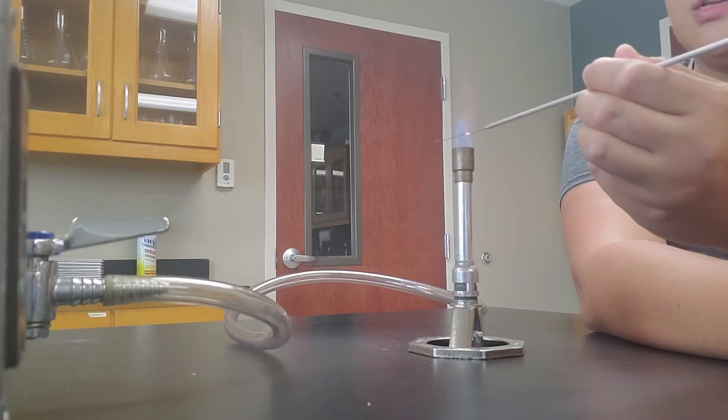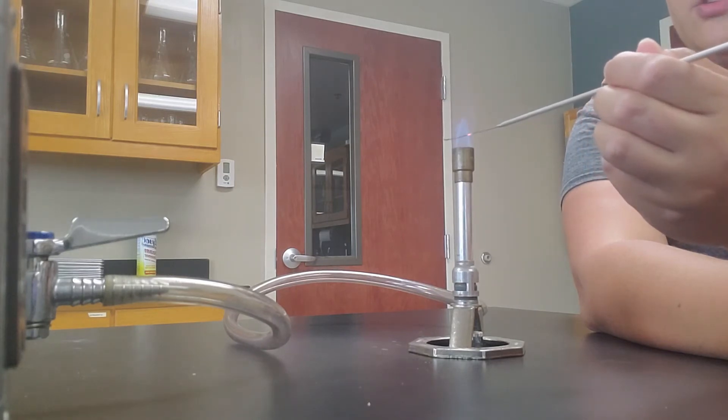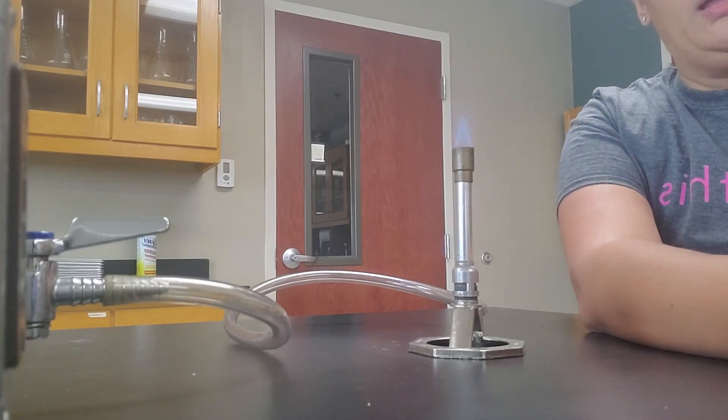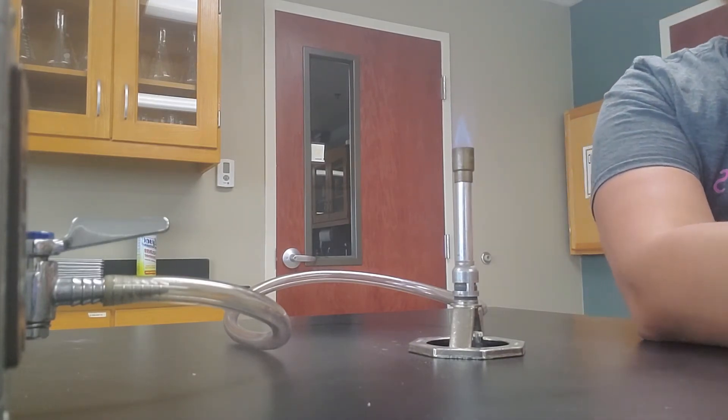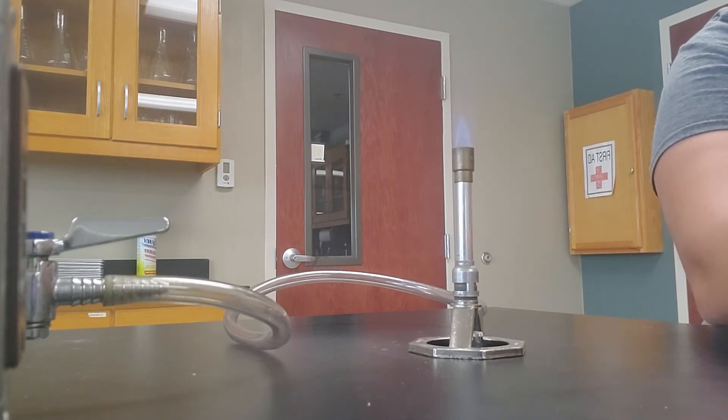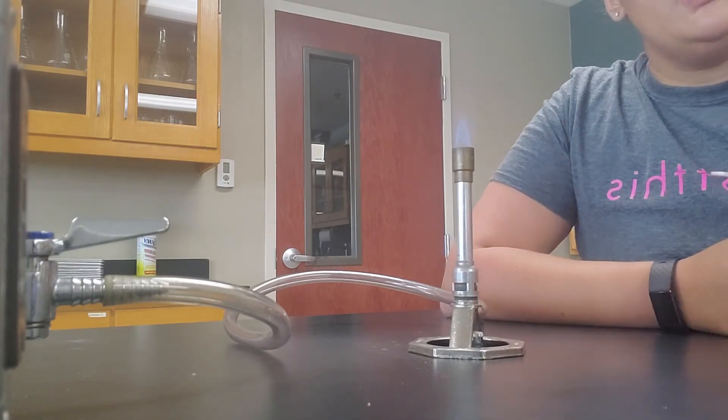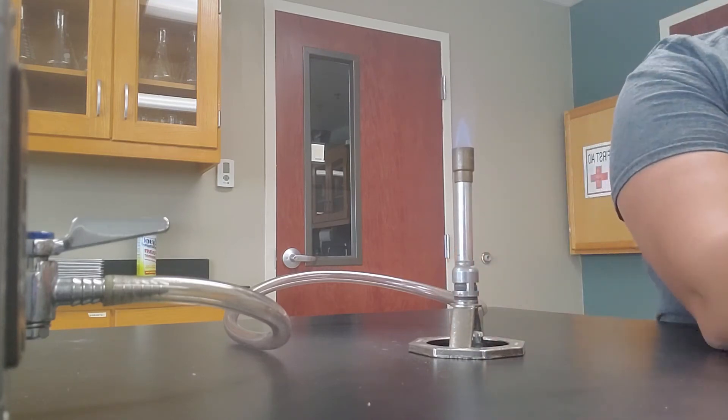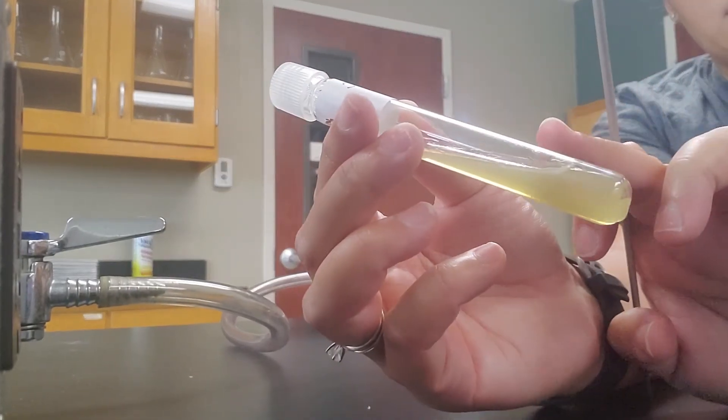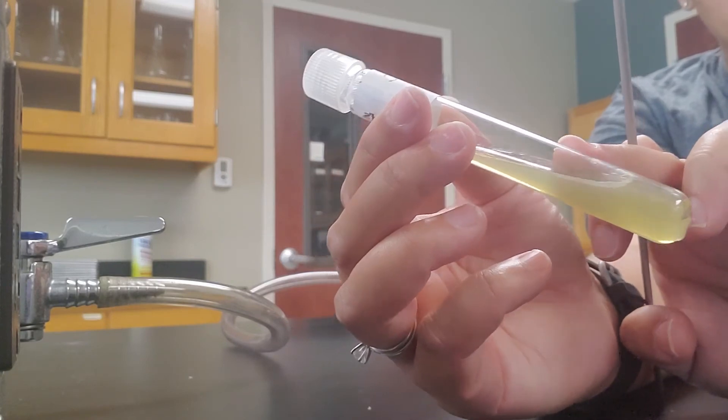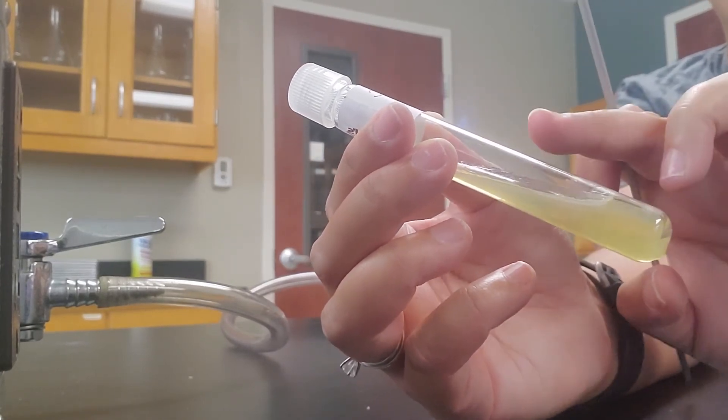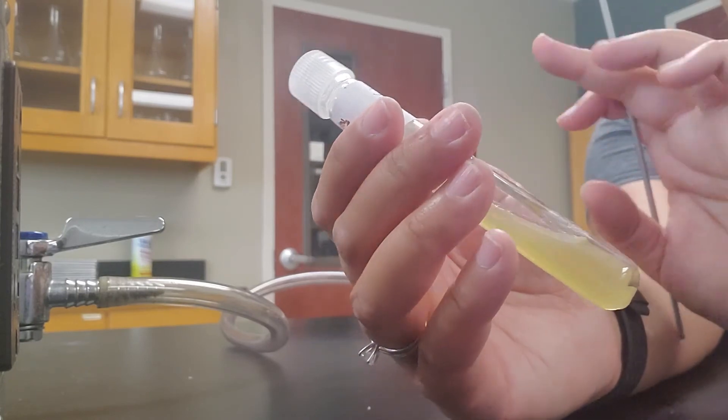So that's the process of an actual transfer between an agar slant to a broth. You can do the same thing going from a broth tube to a slant. And the way that you would do that essentially is by taking a little bit of the broth itself and then just gently going from the base of the tube here and zigzagging your way up, making sure that you don't actually puncture the agar because if you do, you're going to mess up your sample.